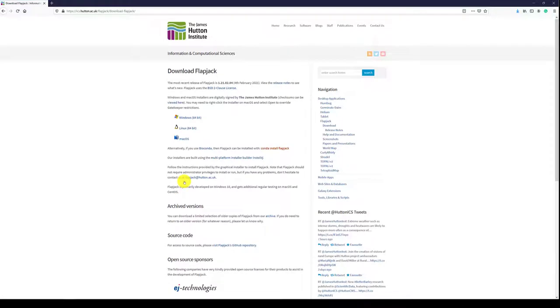Three installers are available: Windows 64-bit, Mac OS, and if you prefer using the command line, a Linux 64-bit version exists.